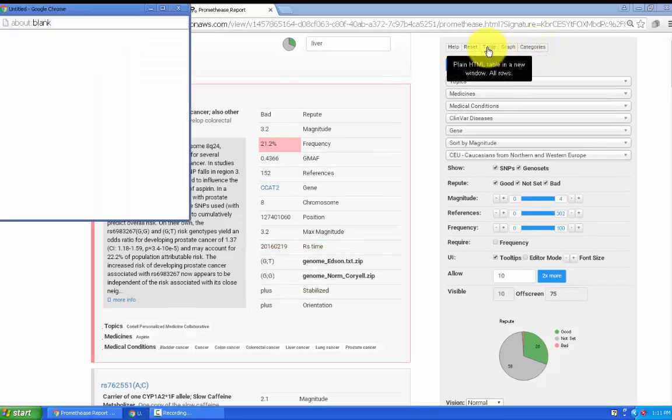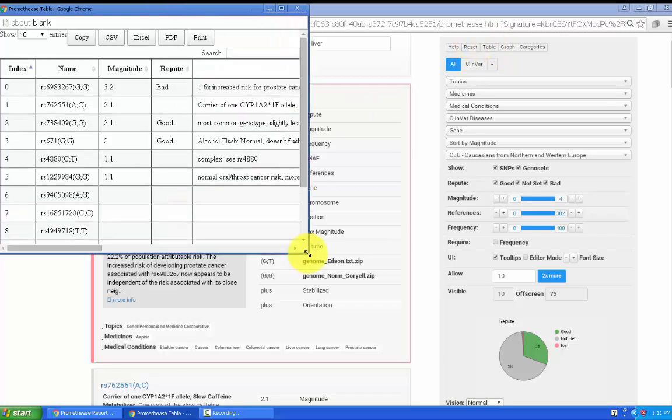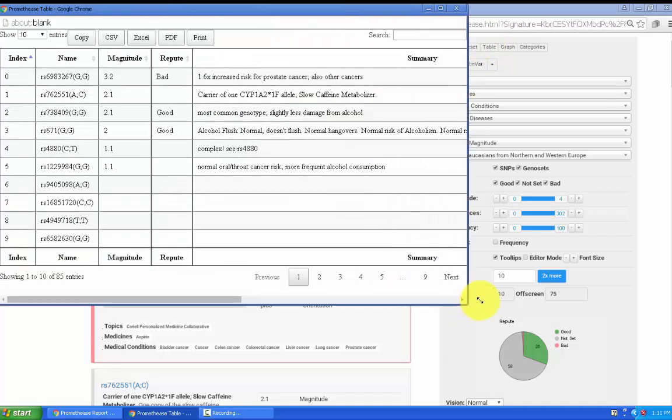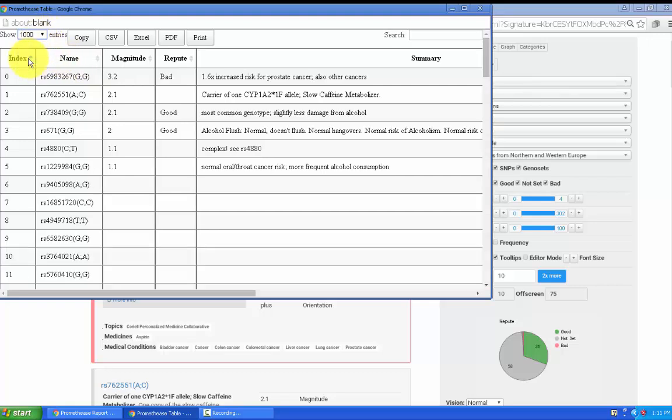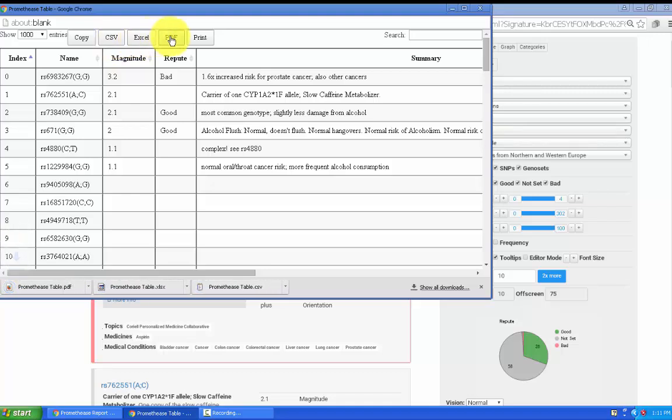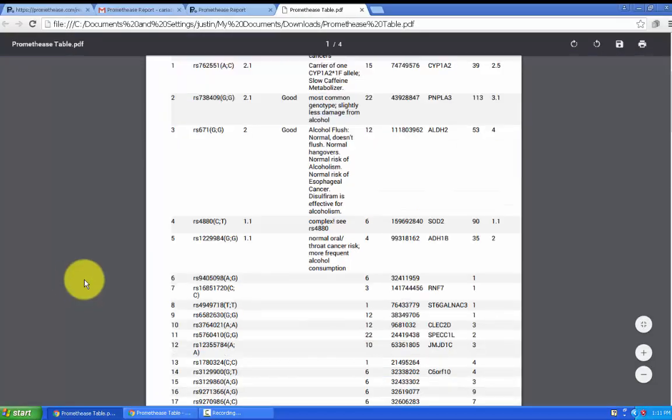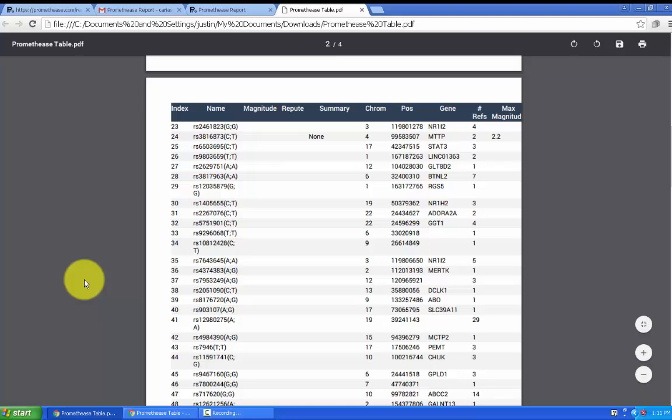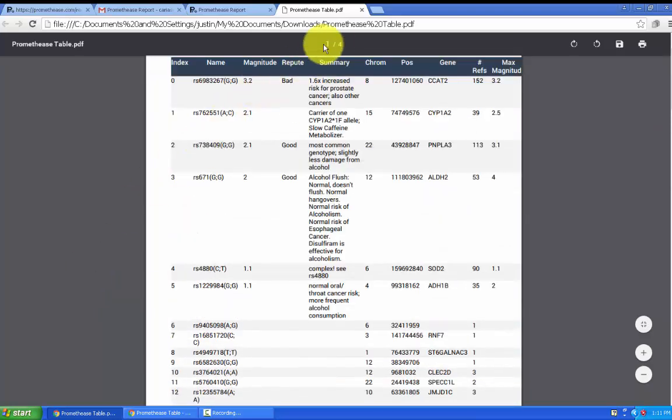Clicking on table brings up a new window with a fairly simple display of major attributes that we track. You can change how many are on screen at one time, export to comma separated values, Excel, or PDF. When I click on the PDF here you can get a sense of what that looks like.